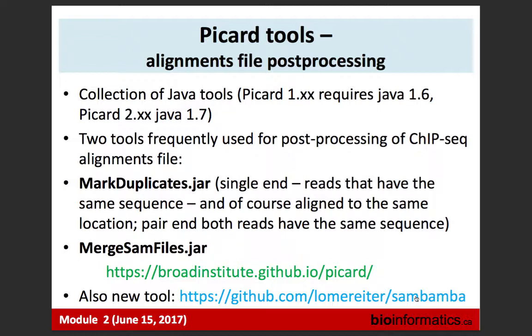With quality, we will also do quality filtering, and by doing so we will remove those multi-mapped reads. The alignment quality tells us how well the aligner can find the place for this read on the genome. If it finds a place in one location, and with nearly the same accuracy it can find another location, then the quality will be low. Of course, if a location has a mismatch, the quality changes. If it's identical in both locations with no mismatches, then the alignment quality is zero. As Martin said, there is a read quality and then an alignment quality.